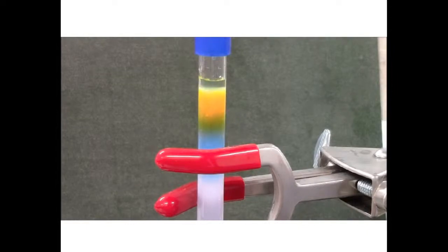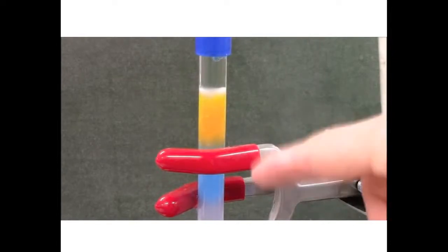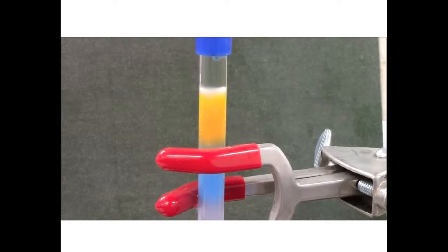If I do this well, then the buffer that I put on top remains colorless because all the colored molecules have already gone into the gel. Alright, now you can start to see a little colorless layer on the top. That's perfect. All the colored molecules are in the G50 and they're starting to separate quite nicely.